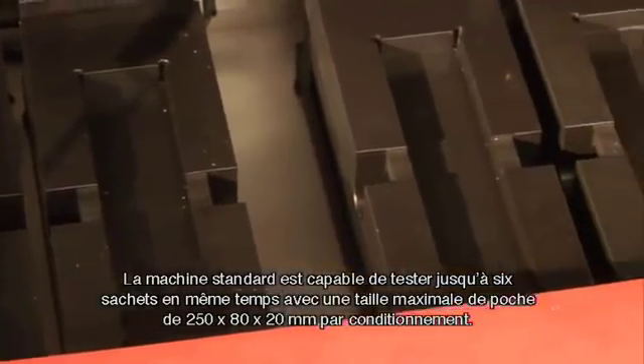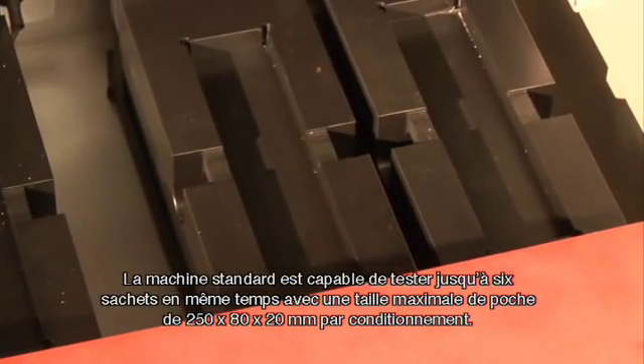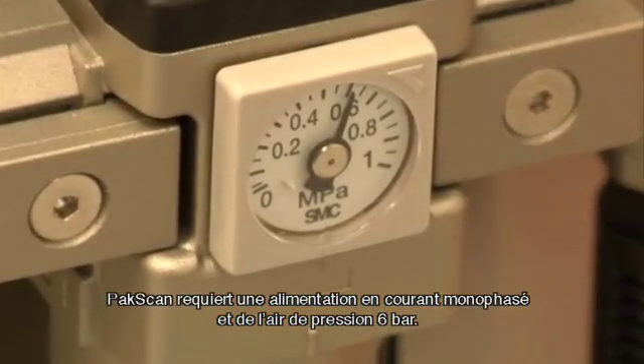The standard machine is capable of testing up to six sachets with a maximum pack size of 250 by 80 by 20 millimeters per pack. PackScan requires a single phase electrical supply and a six bar air supply.